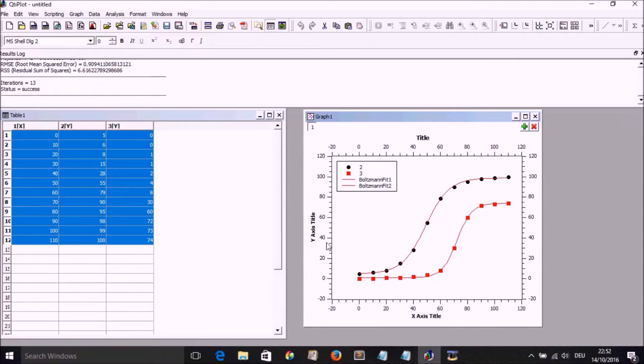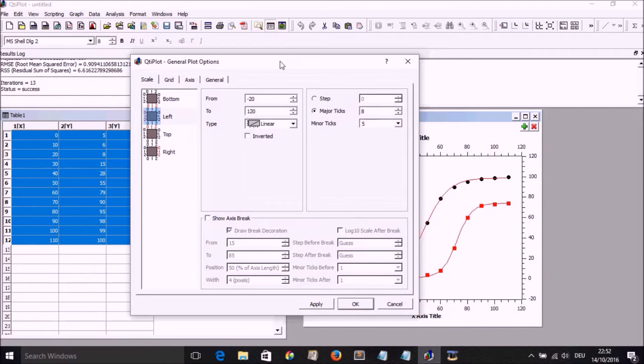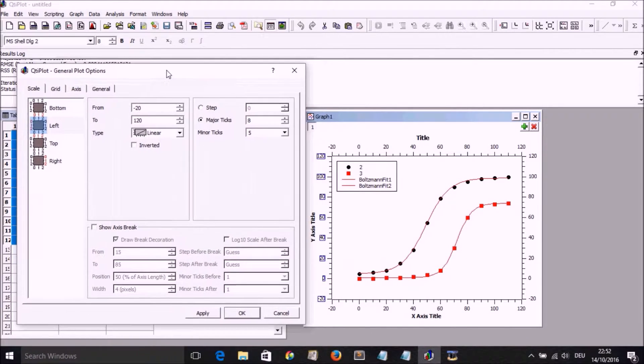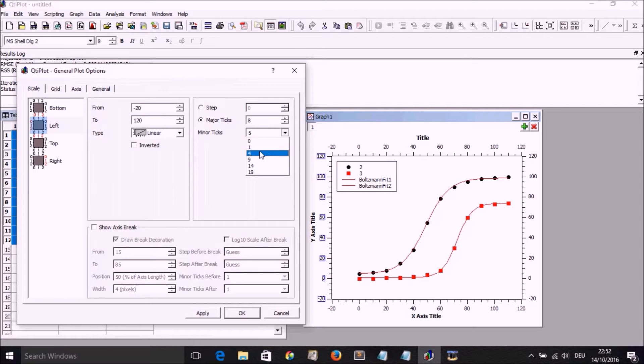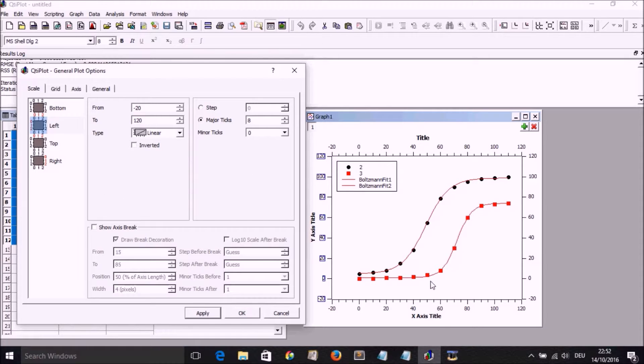So now we may want to double click on the Y axis and then adjust the minor and the major ticks.